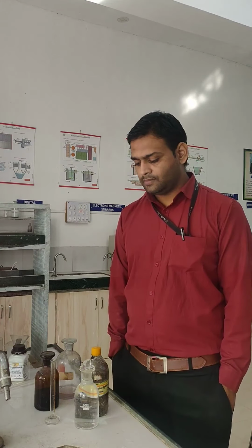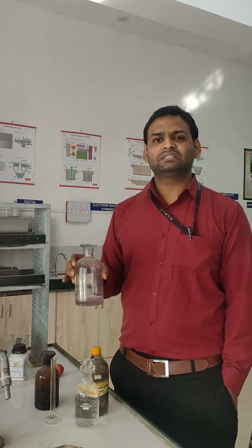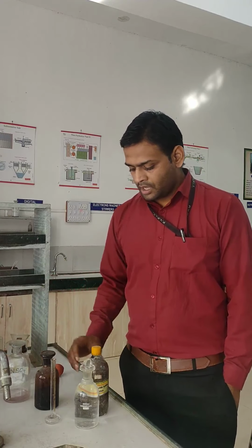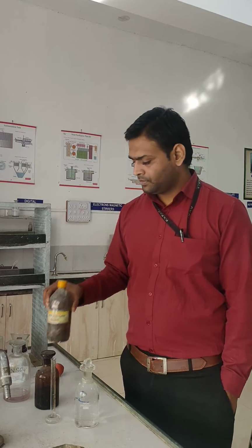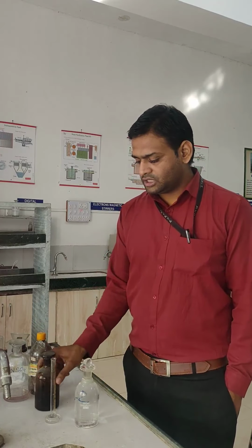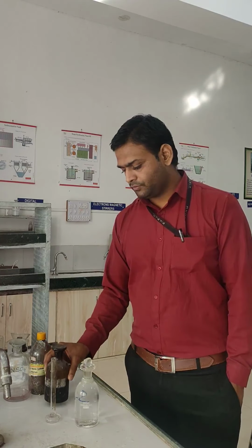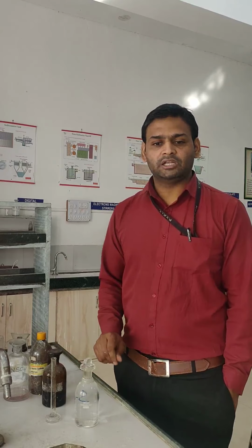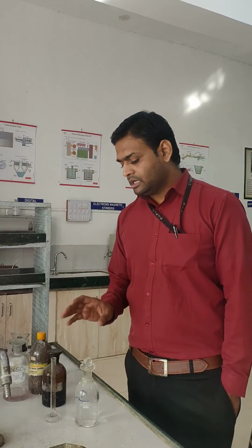Then the chemicals required. First, MnSO4, manganese sulfate, then alkali iodide azide, then concentrated H2SO4 and starch indicator, and sodium thiosulfate as a titrant. We are using 0.025 normality sodium thiosulfate as the titrant.